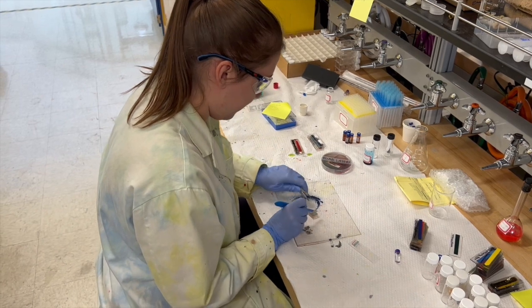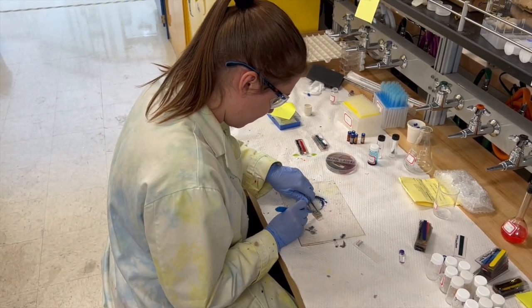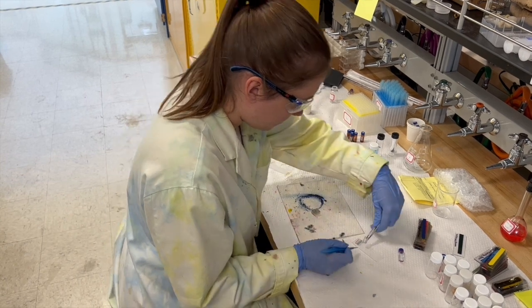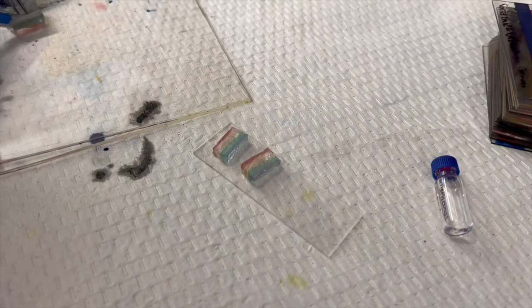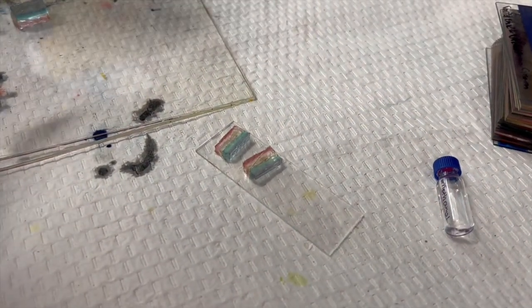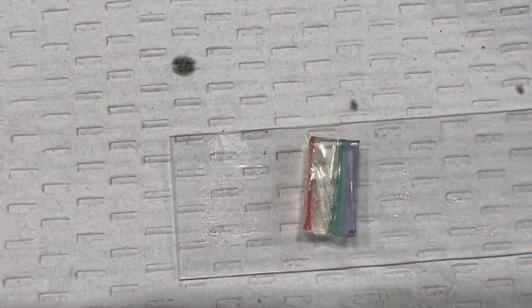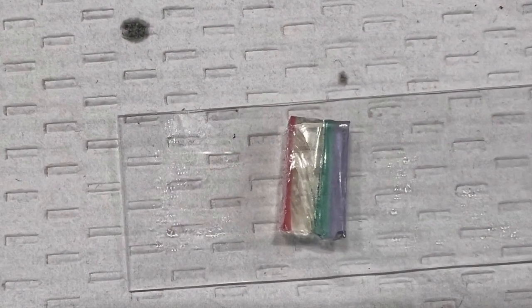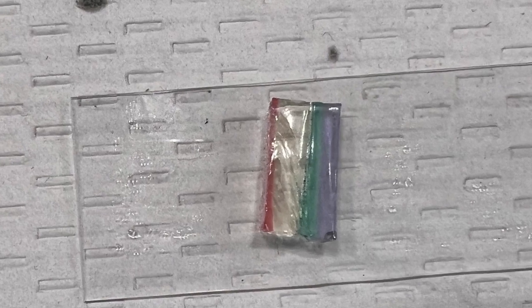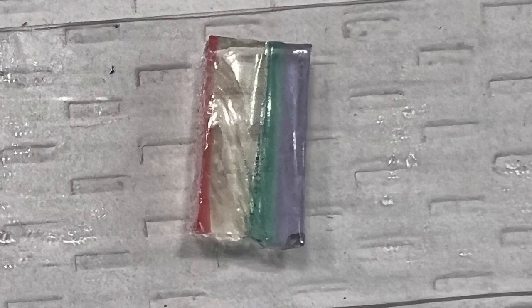In order to perform nanosecond shadowgraphy, however, we need to be able to get light through the sample, so we can't use actual skin. Instead, we have developed transparent mimics of skin using polydimethylsiloxane, or PDMS, a type of plastic that can mimic the mechanical properties of the different layers of skin. We can tint the artificial skin to show the different layers that mimic the epidermis, the dermis, and the hypodermis.